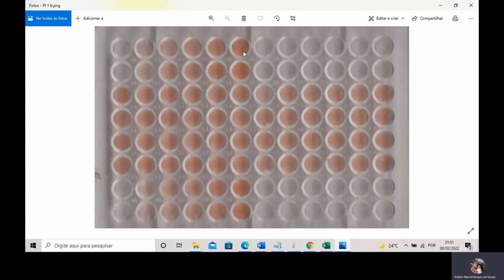but it is a very time-consuming process, and it is also boring. You can do this automatically. You can do this in a very fast manner using ReadPlate. It's very fast and also very simple. I am showing you how to do it.